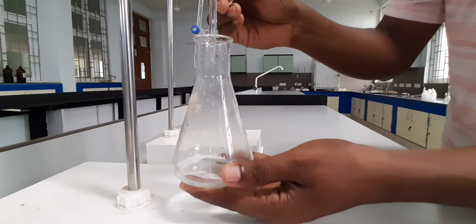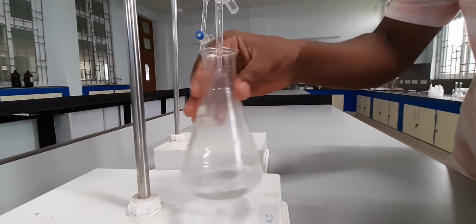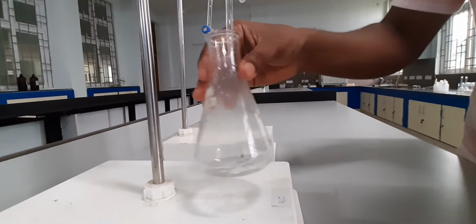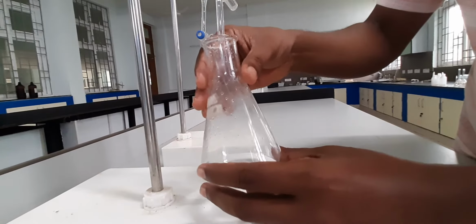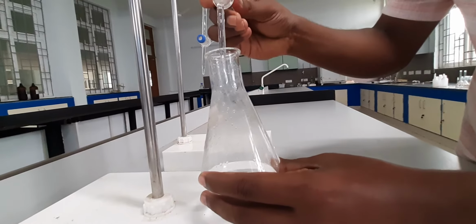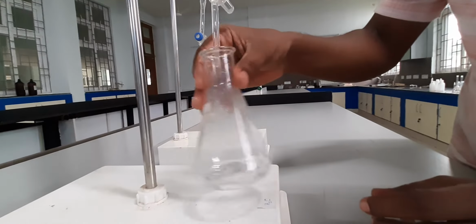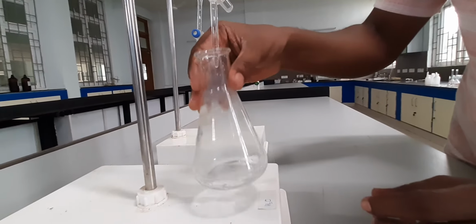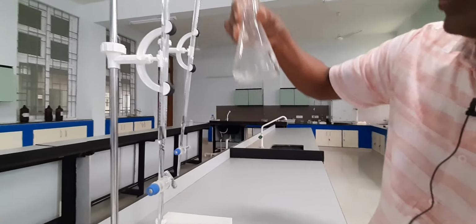Okay, so I started adding. I just add slowly because we do not know where exactly we will find the turbidity. So it is always better that you add a few drops and then dispense, and you have to follow the titration experiment precautions as well. You cannot add everything at once and then start swirling.